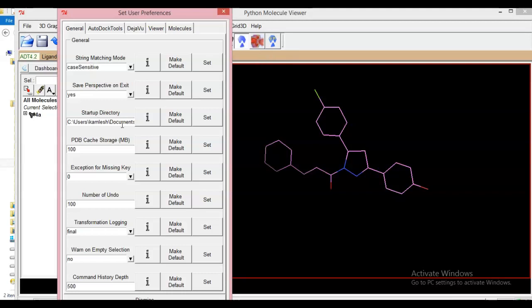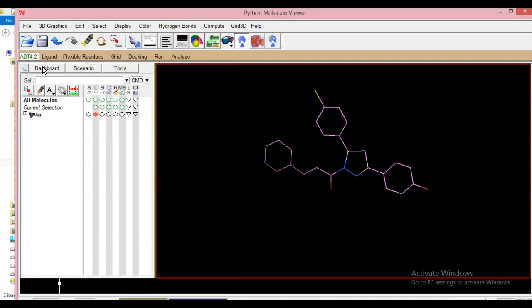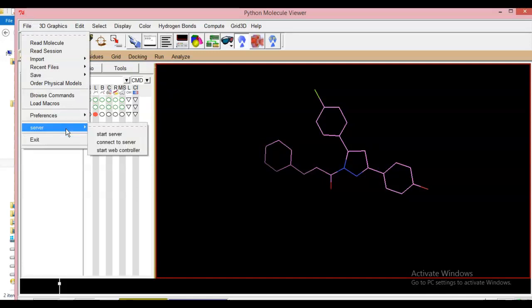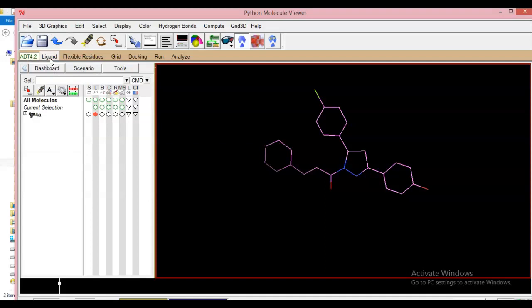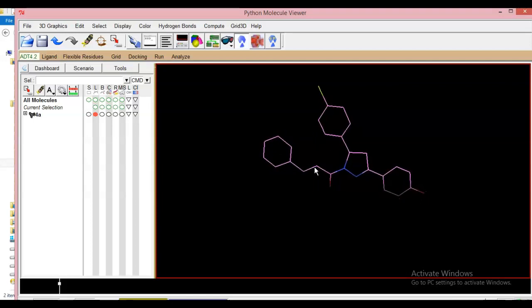Now whenever you open any file, that tab or file location will be directed toward the location you have set. There is also an Exit option if you want to close this application. Then there is Ligand — a ligand means our drug molecule which has to bind, or which is going to be docked, in a particular receptor pocket. That you have to design.